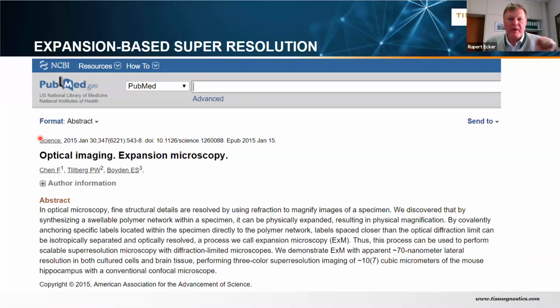It's like when you blow up a balloon. Two points close to each other get further apart. So you in fact increase the optical resolution. Now, resolution in optics is determined as the ability to resolve two dots close to each other and see them as two rather than as one. When you blow up the balloon and the two dots get further apart, that means you increase the resolution by leaving the optical magnification and the numerical aperture of your optical light path the same.